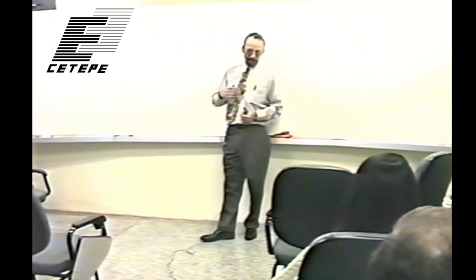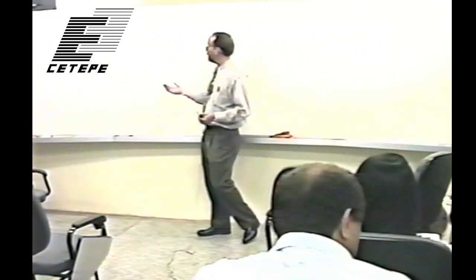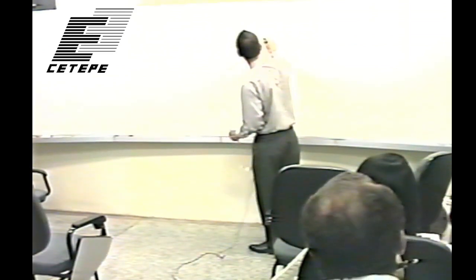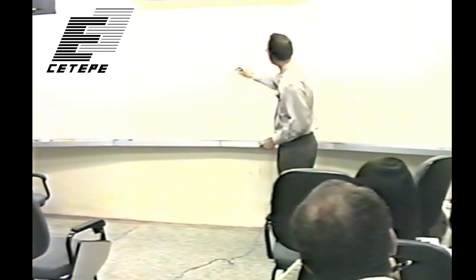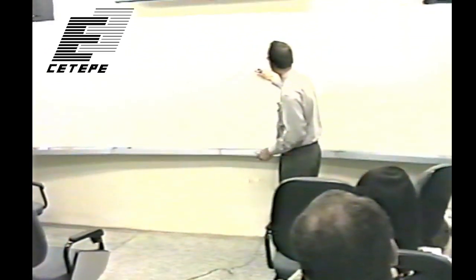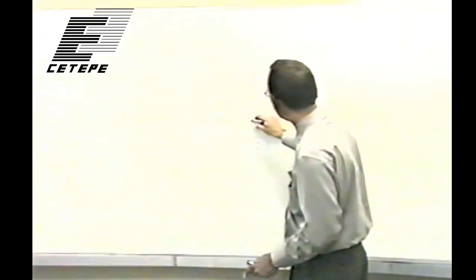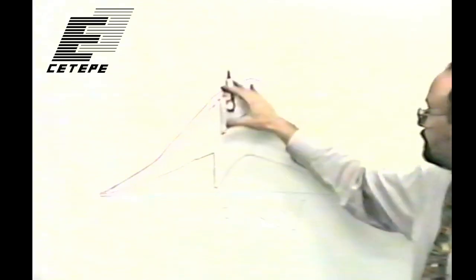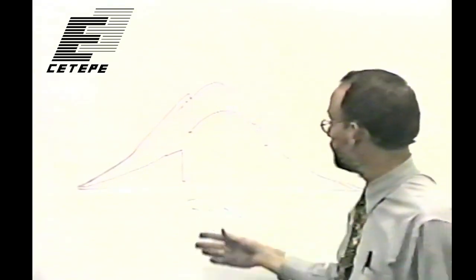Because if you throw a very thin filter in the beam, a very thin filter is just going to have very little effect. So you want to put a thicker and thicker, a very thick filter. Well, actually, what a very thick filter would do would be this, and this is the whole problem. You lose all this energy in here for imaging. So there's some compromise between how thick a filter you put in and whether it does you any use. So that's the K-edge concept.